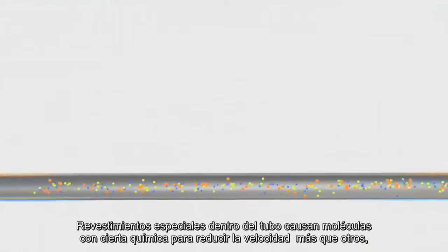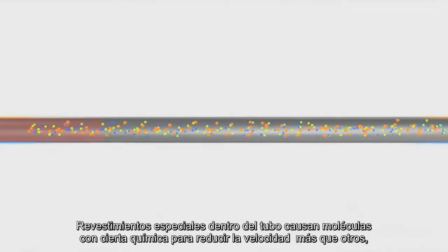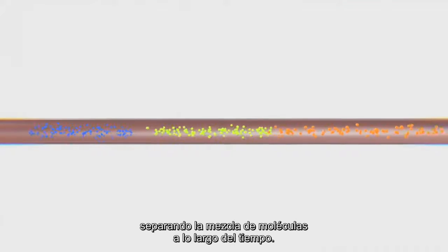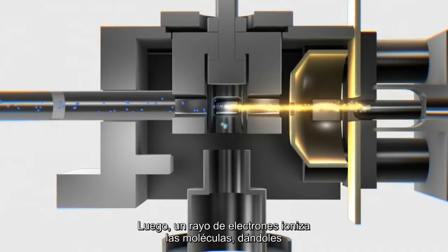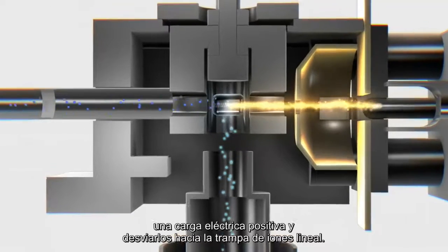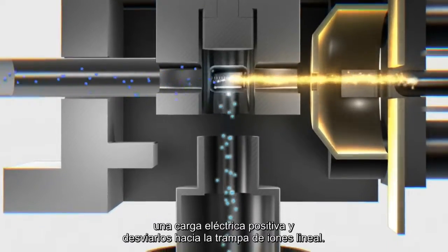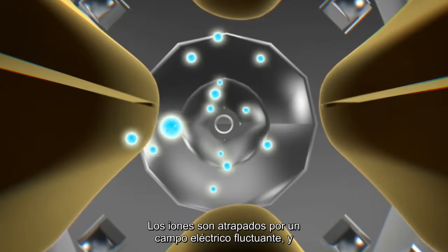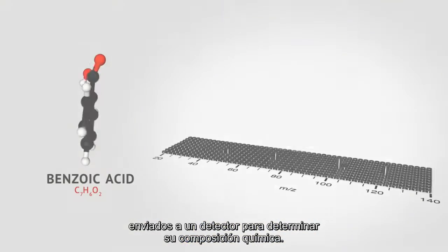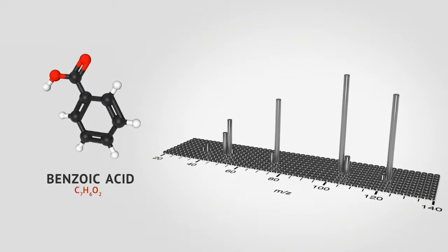Special coatings inside the tube cause molecules with certain chemistries to slow down more than others, separating the mixture of molecules over time. Next, a beam of electrons ionizes the molecules, giving them a positive electric charge and deflecting them towards the linear ion trap. The ions are caught by a fluctuating electric field and sent to a detector to determine the chemical makeup.